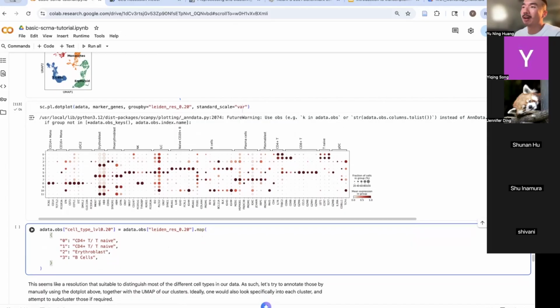So this is the tricky part, because sometimes if you find the marker genes like this, here, these genes do not show up in here. So maybe you didn't find the best marker genes, or you can just make it cleaner. So remove some of these, maybe I will remove this, and then maybe these, I will remove them.